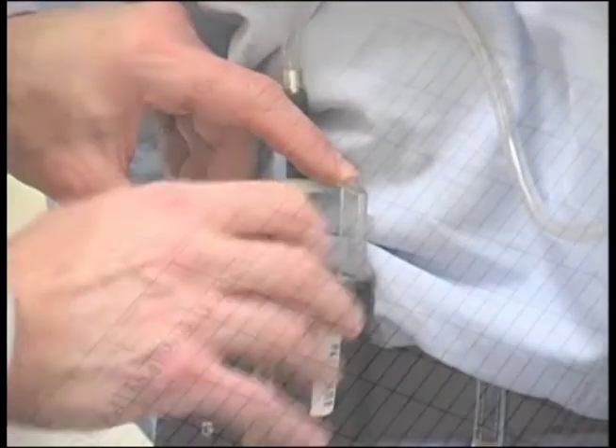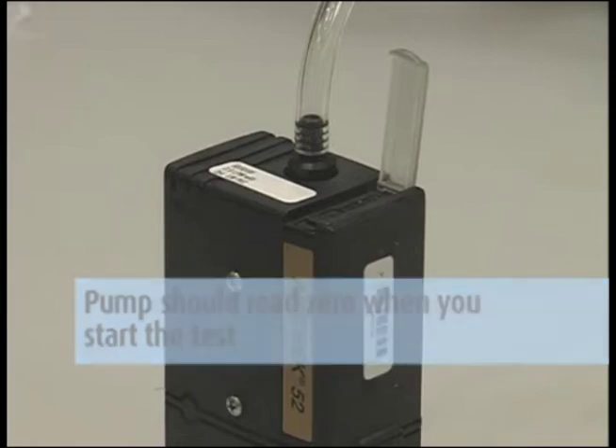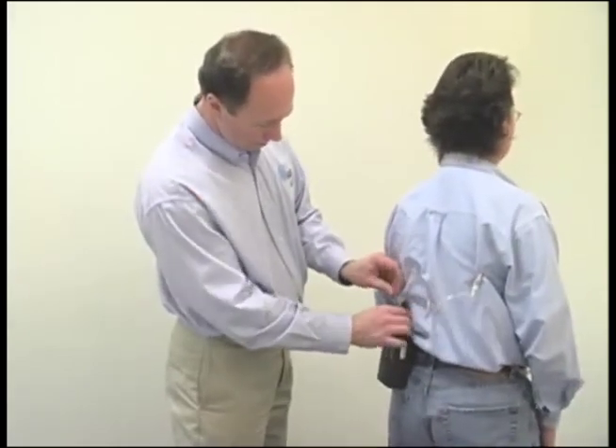Turn on the pump and record the starting time to the minute and the initial flow rate. The counter records the minutes the pump is operating and should read zero when you start the test. You can enter the time and counter number notes on the field pump data sheet. Observe the pump operation for a short time after starting to make sure it is operating correctly.